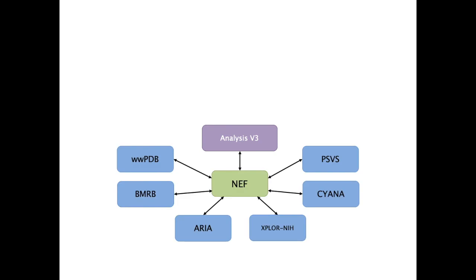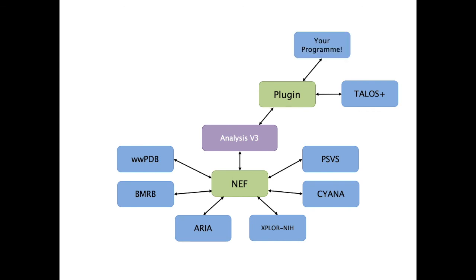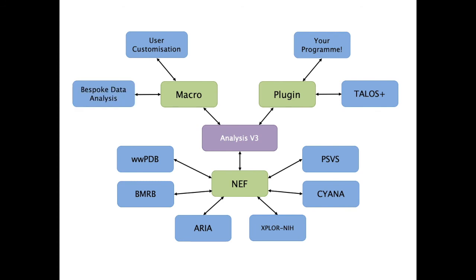So to sum up the way in which we see analysis version 3 interacting with other programs, we've got NEF, which will allow us to interact with structure calculation and structure validation programs and also the deposition databases. We've got plugins as a means to connect to those programs that are not NEF compatible, and in the future perhaps also as a means to connect to your program. And then there are macros, which will allow users to do some of their own customization and perhaps their own bespoke data analysis on a slightly smaller scale.